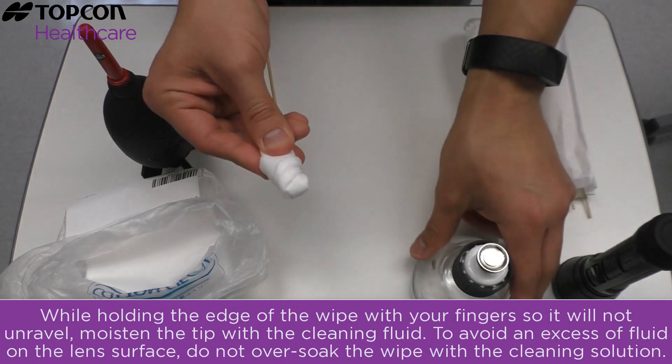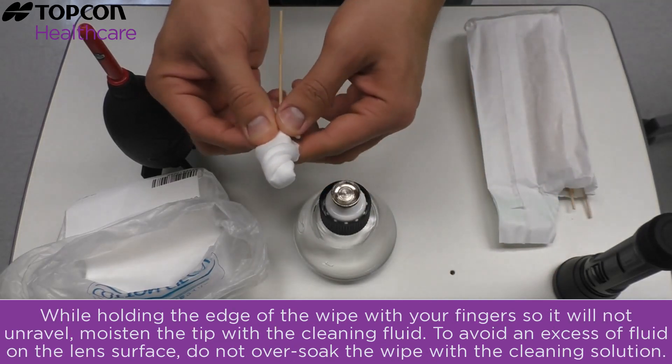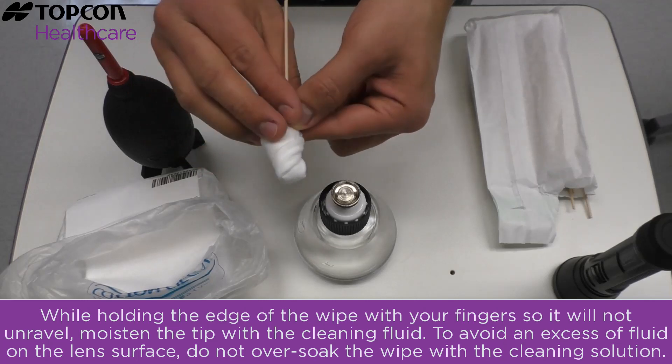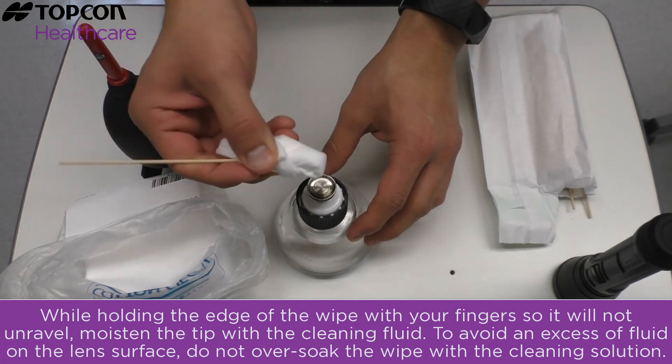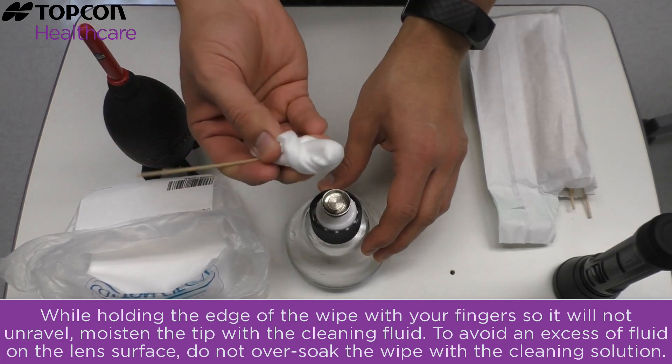While holding the edge of the wipe with your fingers so it will not unravel, moisten the tip with the cleaning fluid. To avoid an excess of fluid on the lens surface, do not over-soak the wipe with the cleaning solution.